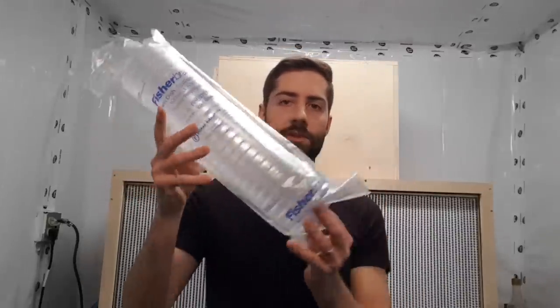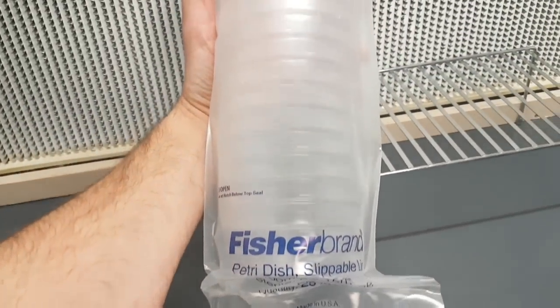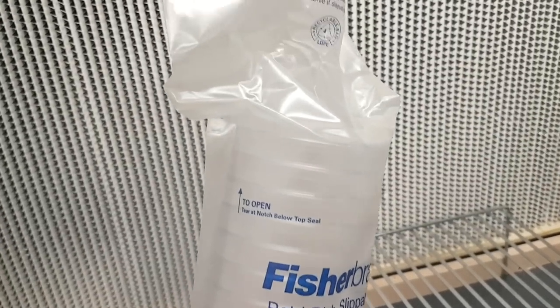Now let's talk about the other things you need for a functional mushroom lab at home. First: petri dishes. These are used to make agar plates for growing out mushroom cultures or growing mushrooms from spores. They usually come pre-sterilized in a sleeve — sterile in the bag and ready to go. These plastic dishes are one-time use but relatively inexpensive. If you don't want petri dishes, you can use little mason jars or jam jars, which work pretty well and can be reused, though it's harder to see your culture through the lids.